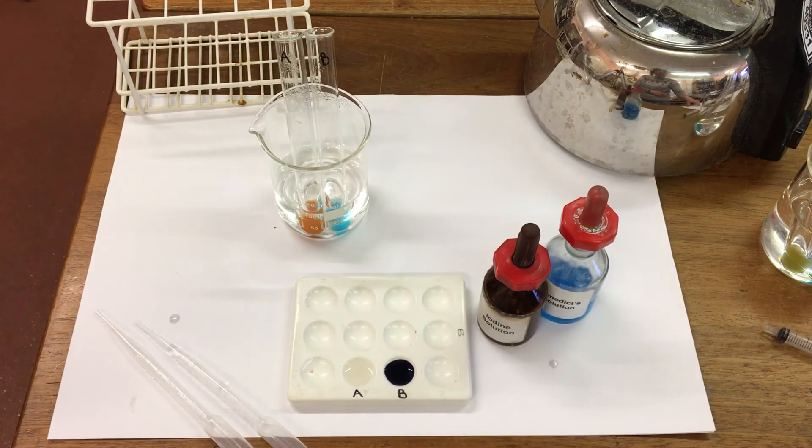So the brick red color means all the starch has been broken down into glucose. We've got a positive test for glucose in A, and in B the Benedict's stays blue.